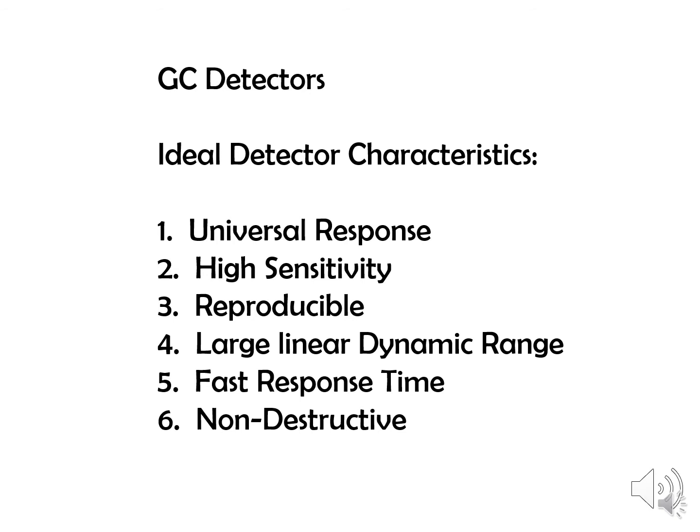The detectors, GC detectors: you have ideal detector characteristics. You'd like a detector that would detect everything, a universal response.